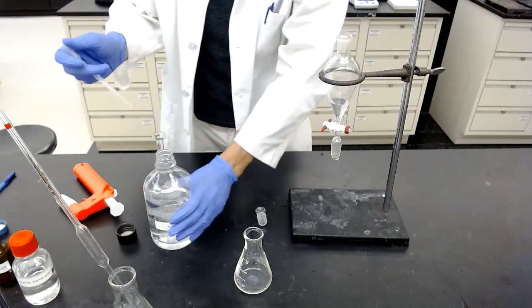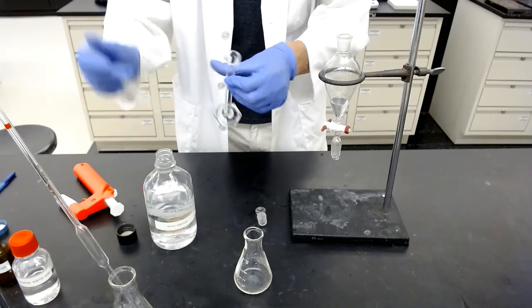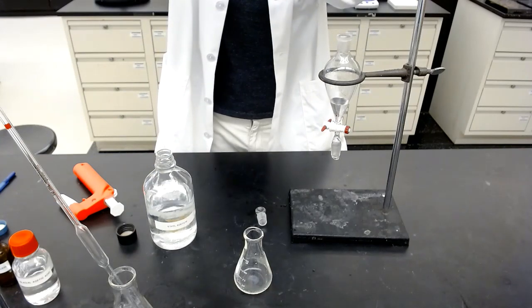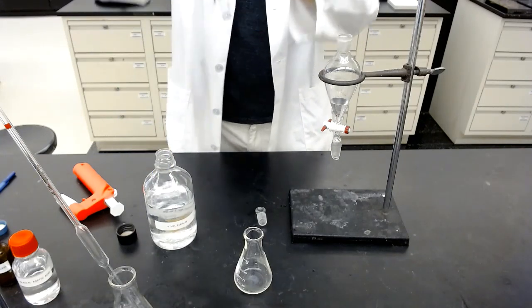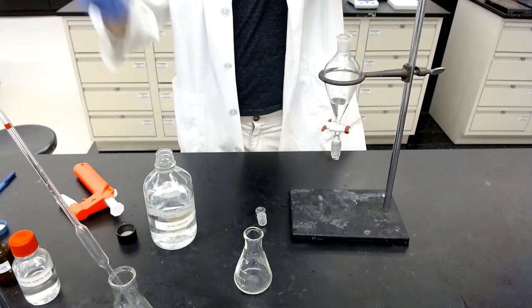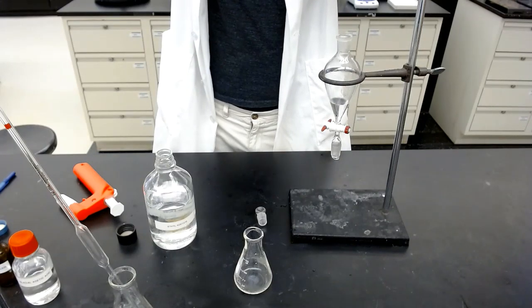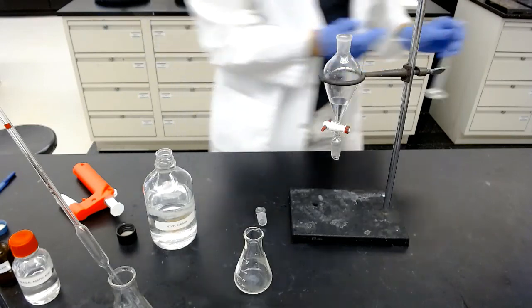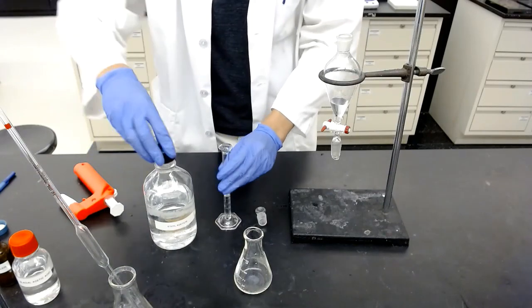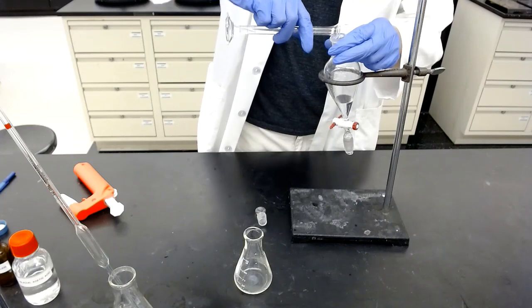We're going to extract it with another 5 ml of fresh ethyl acetate. Pour to the separatory funnel.